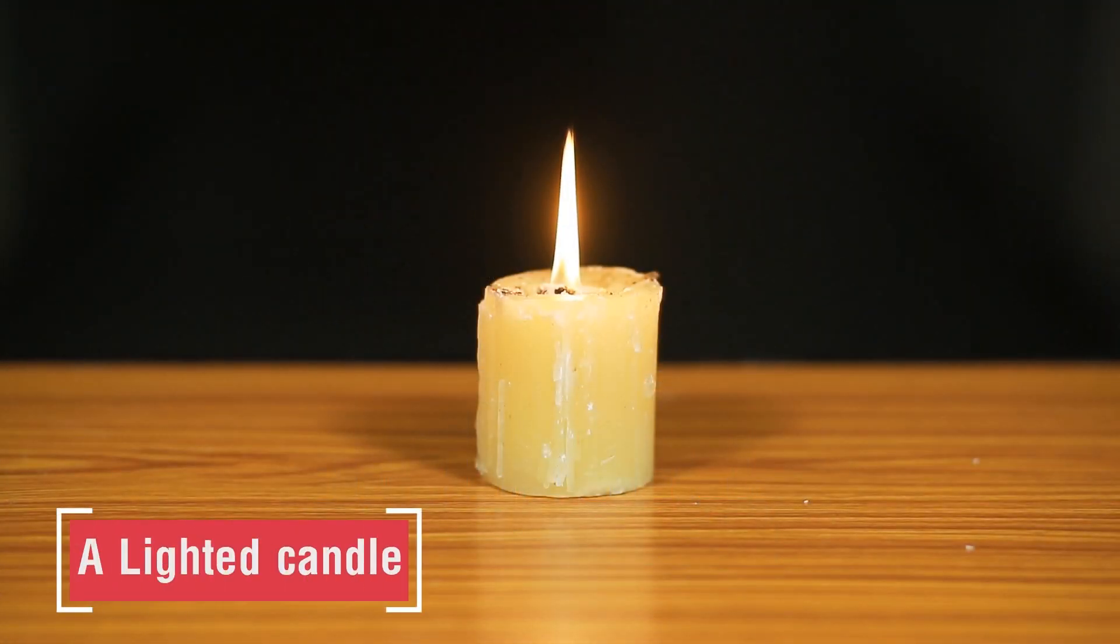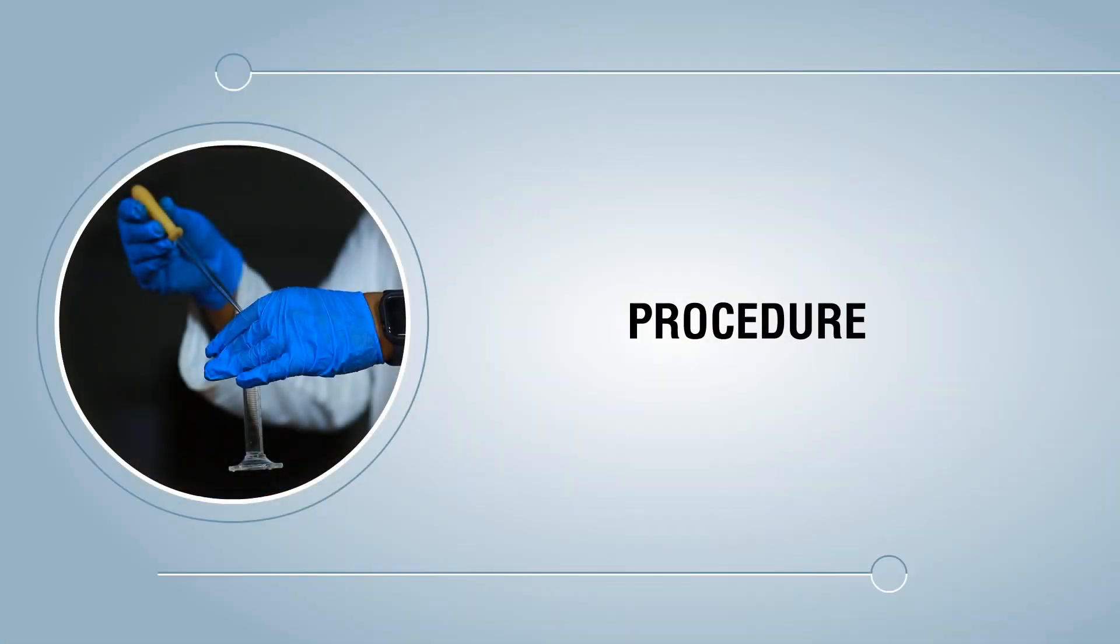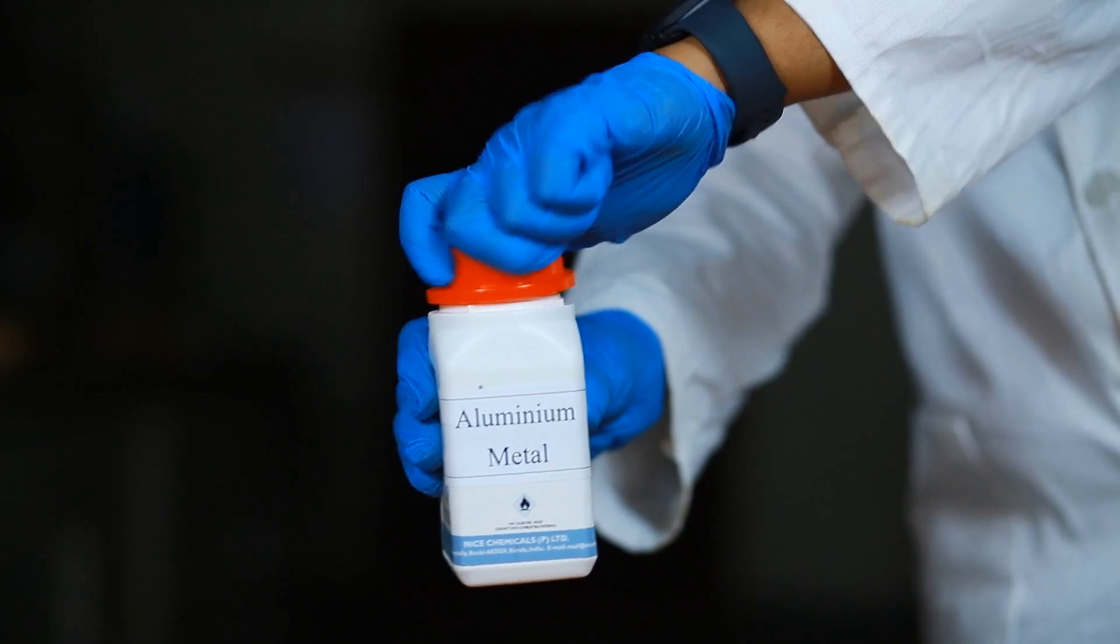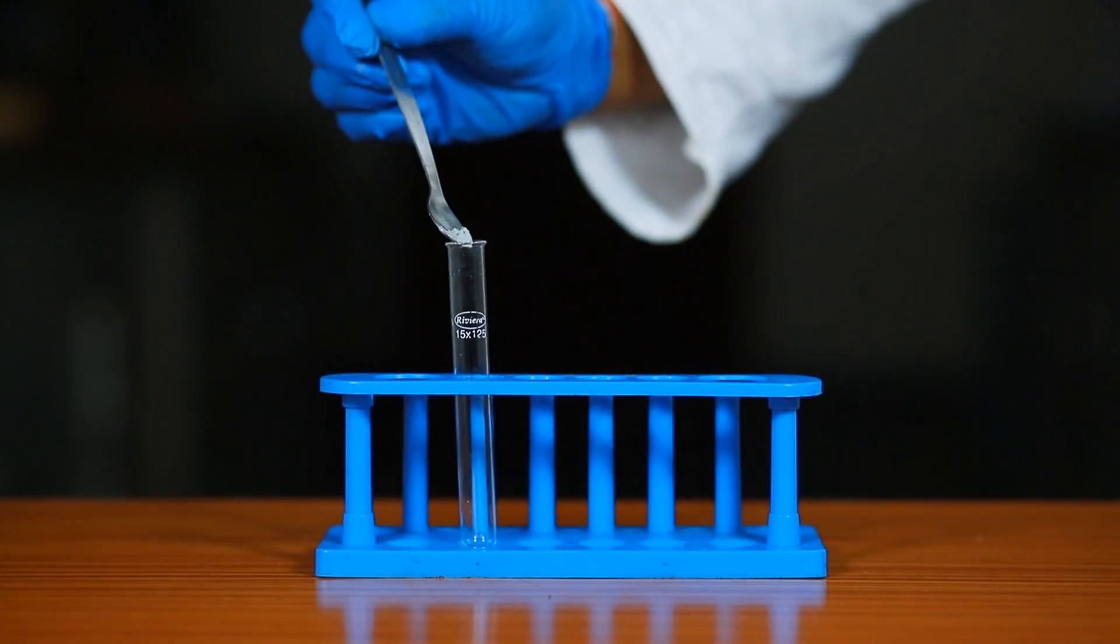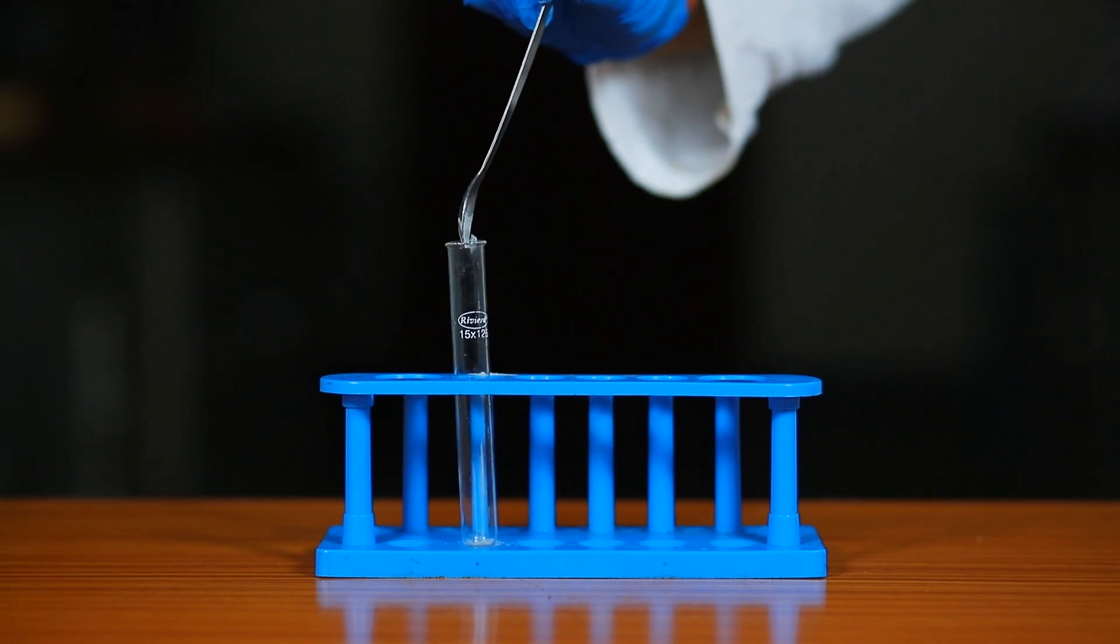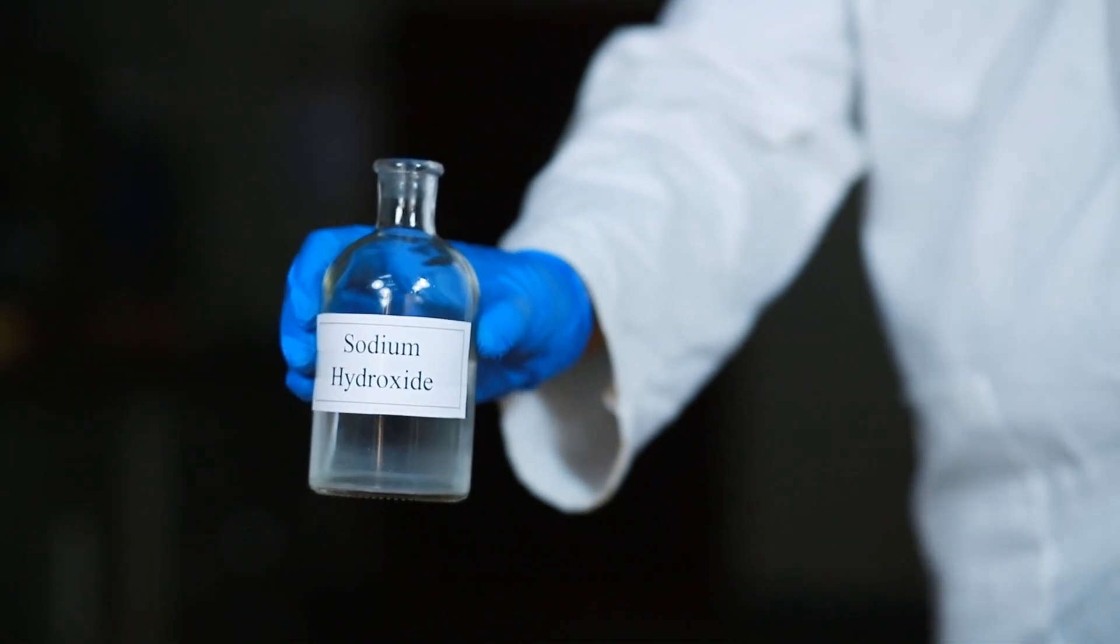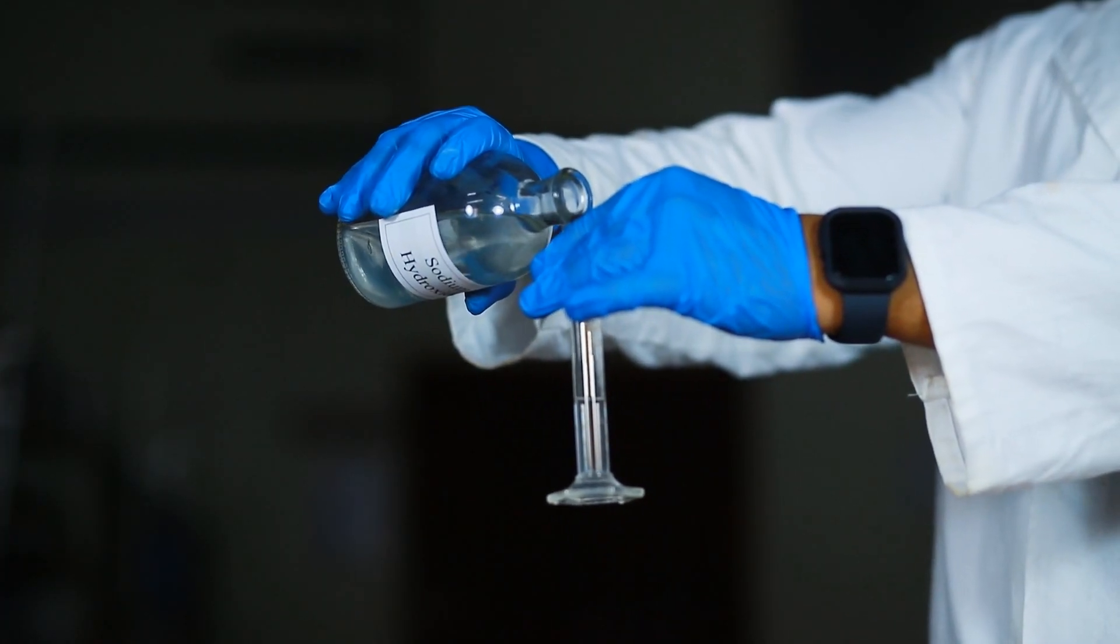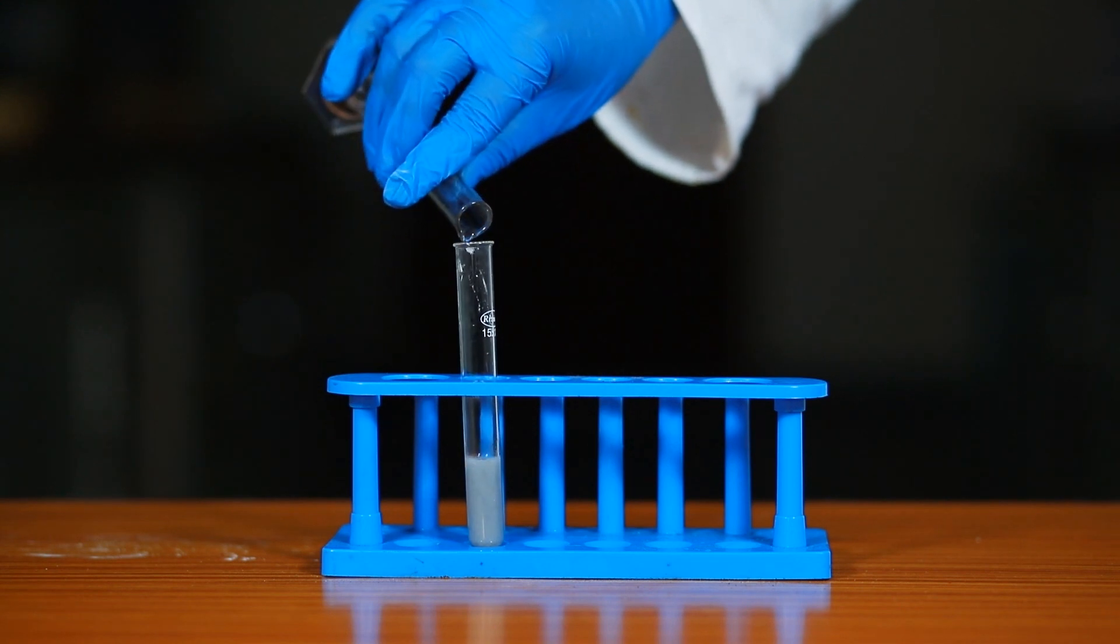Procedure: take two pieces of aluminium metal using a spatula and put the aluminium metal into a test tube placed in the test tube stand. Take about 5 ml sodium hydroxide solution in a measuring cylinder and pour it into the test tube containing aluminium metal.